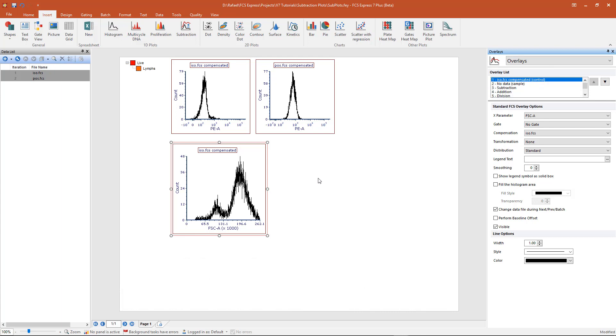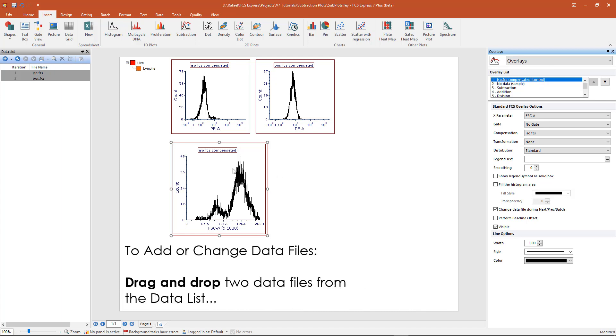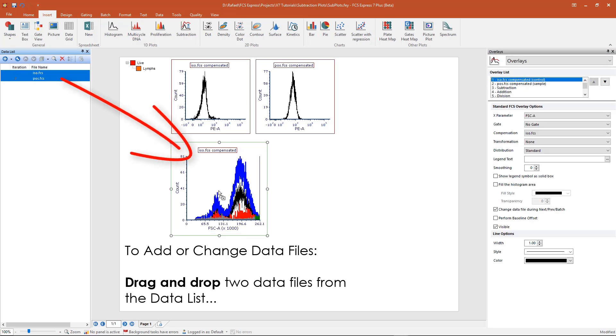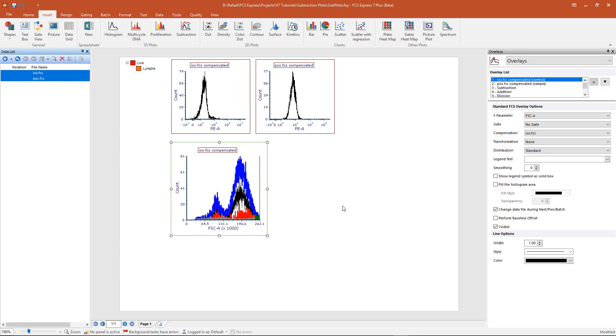Data files can be added or changed on the subtraction plot by dragging and dropping two data files from the data list onto the subtraction plot. This will replace both overlays with the specified files for the control and the sample.